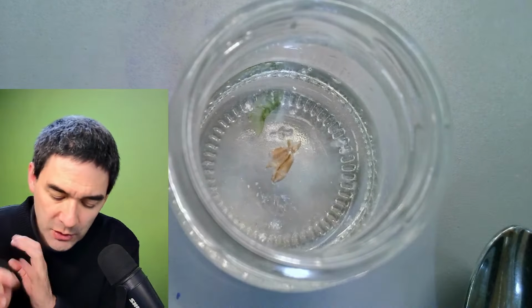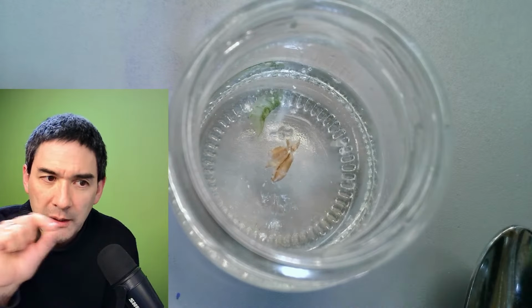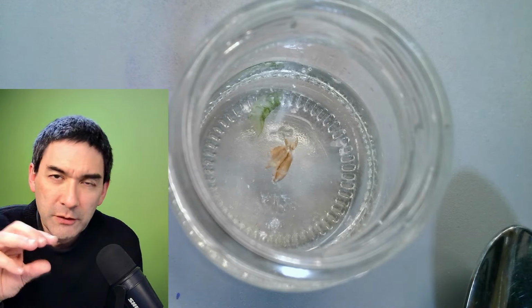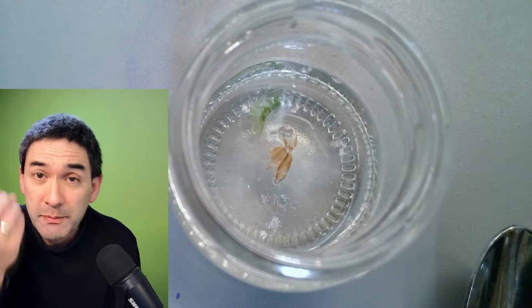you have to wait. You're going to see that it's going to start to become very slimy. And then what's going to happen is there in the slime layer, which seems to be maybe some kind of a polysaccharide, you find a lot of these microorganisms, especially paramecia.